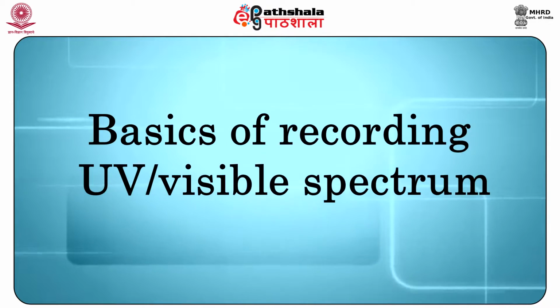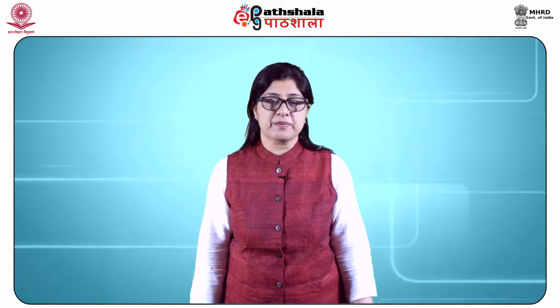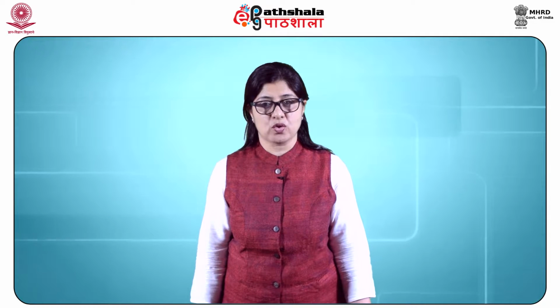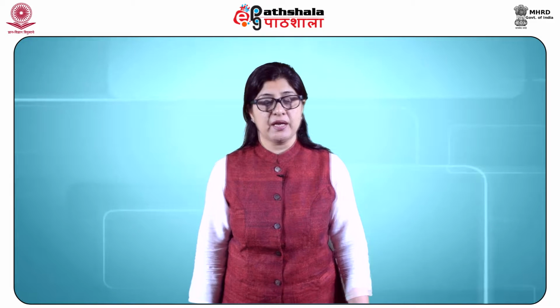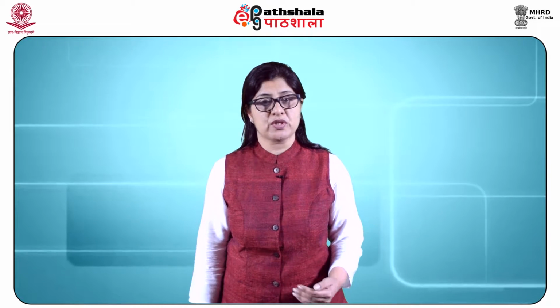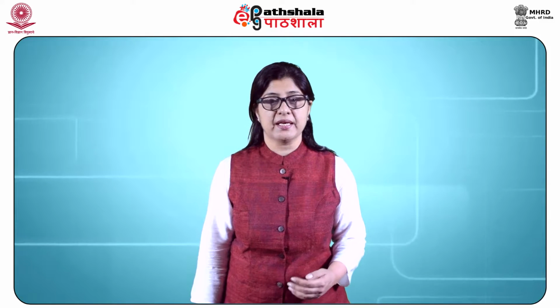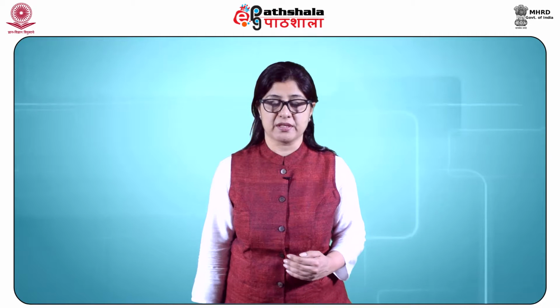What are the basics of recording a UV visible spectrum? Common UV visible spectrophotometers record the spectra over the range of 200 to 800 nanometers. That is, in the ultraviolet region, which is in the range of 200 to 400 nanometers, and in the visible region, which is from 400 to 800 nanometers.